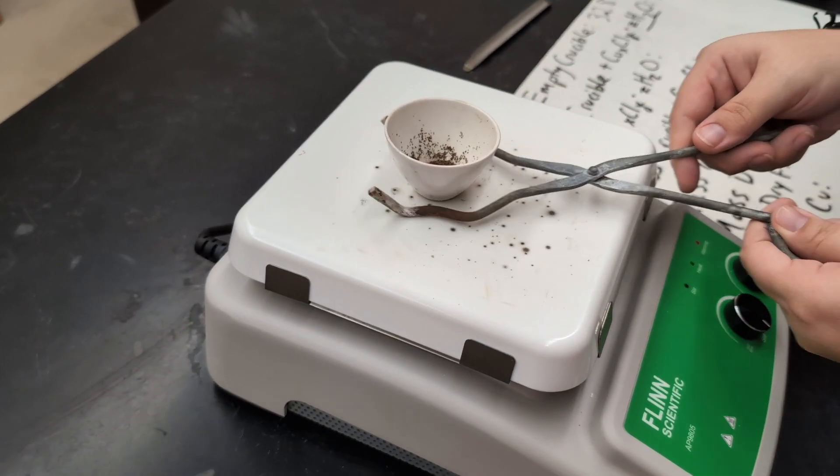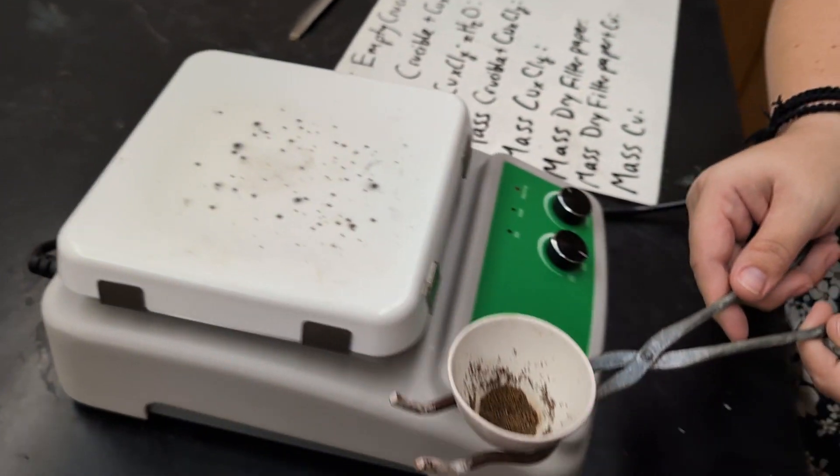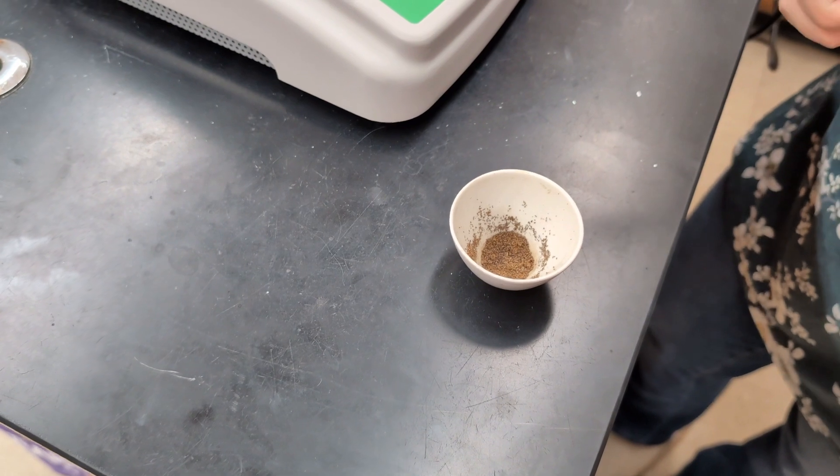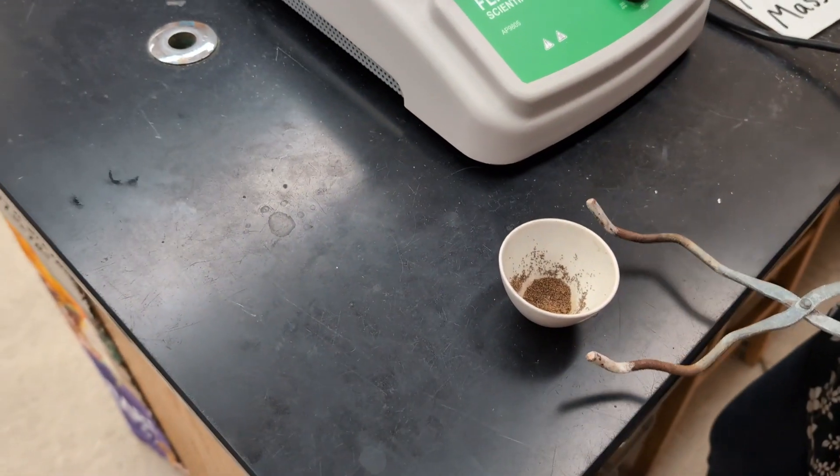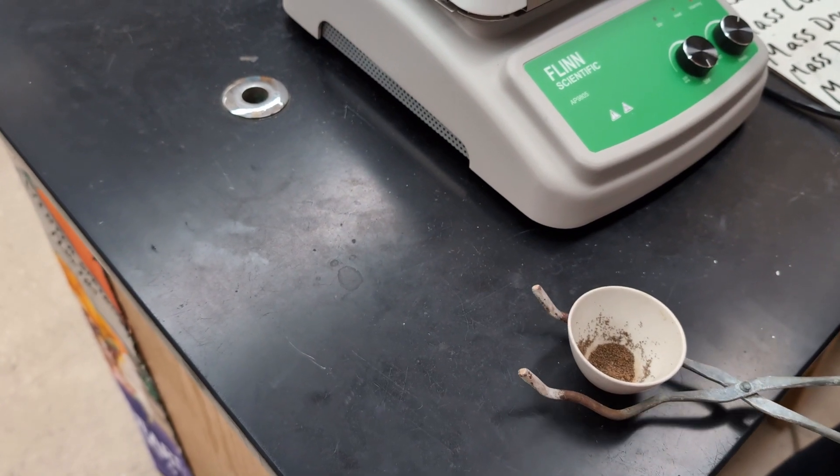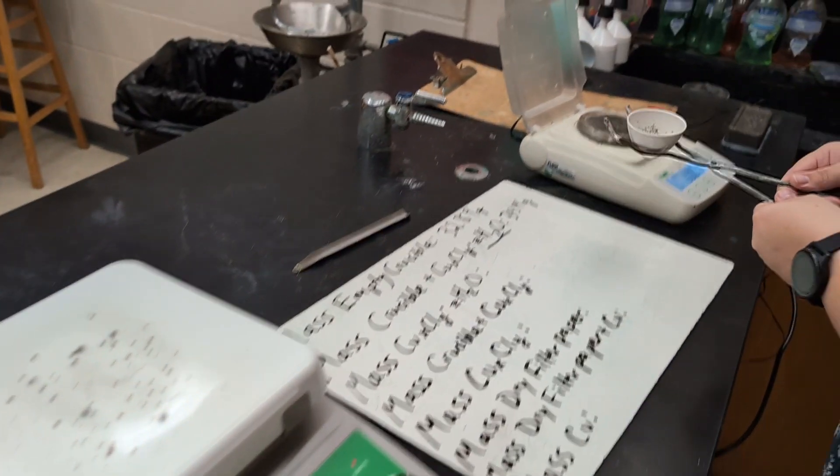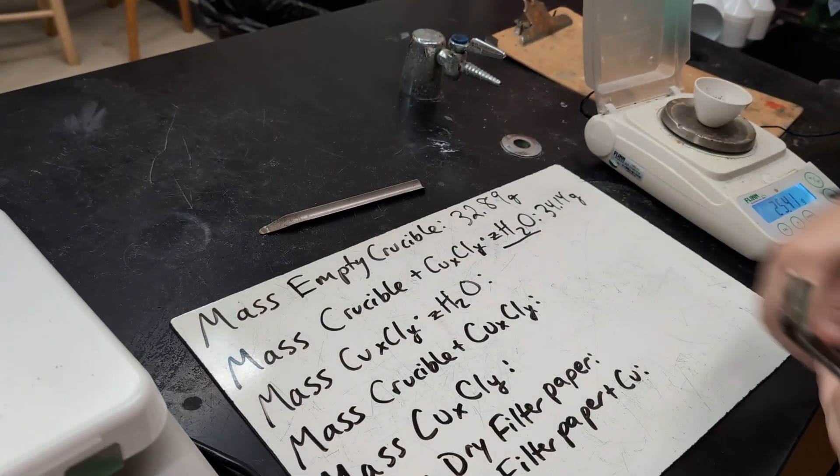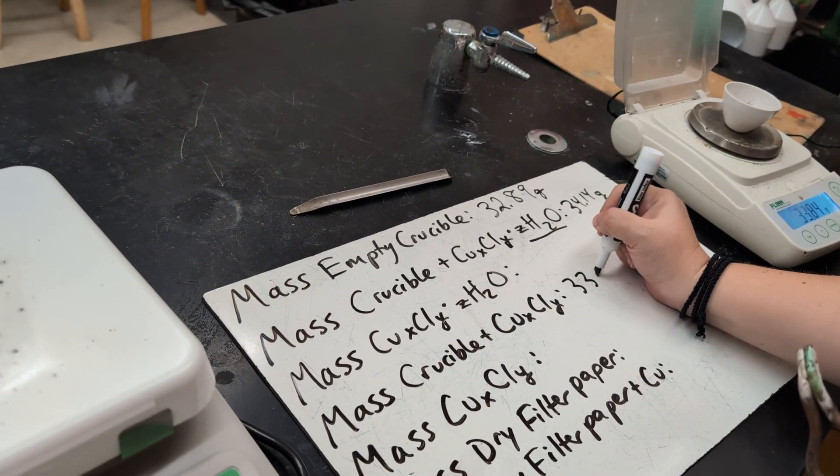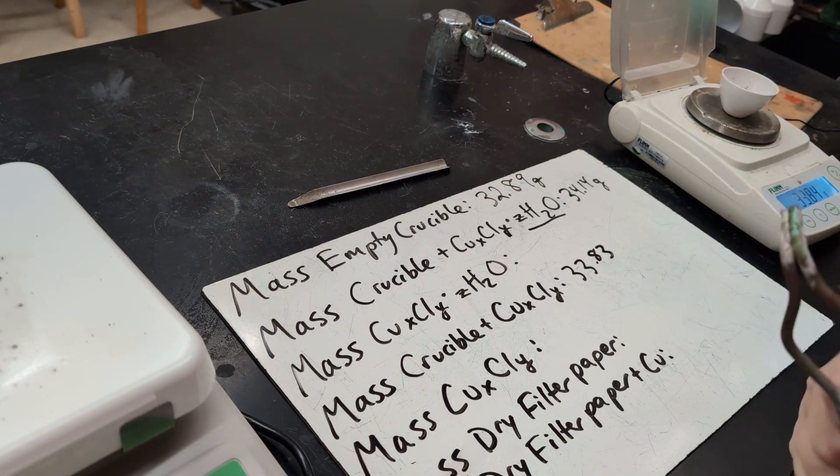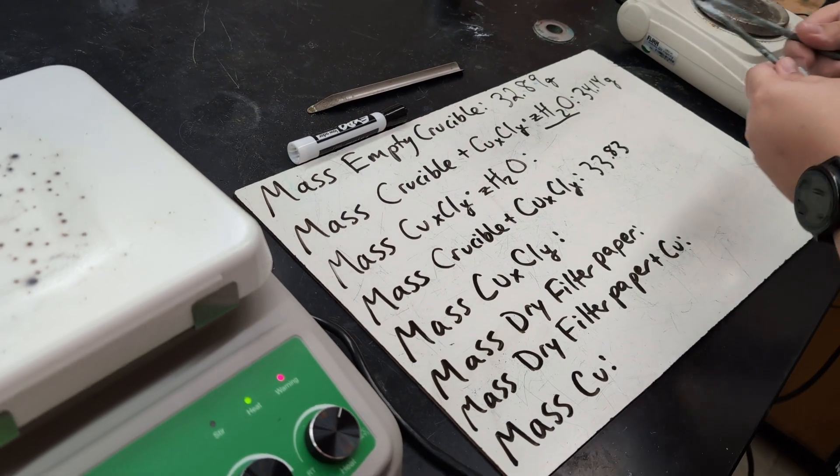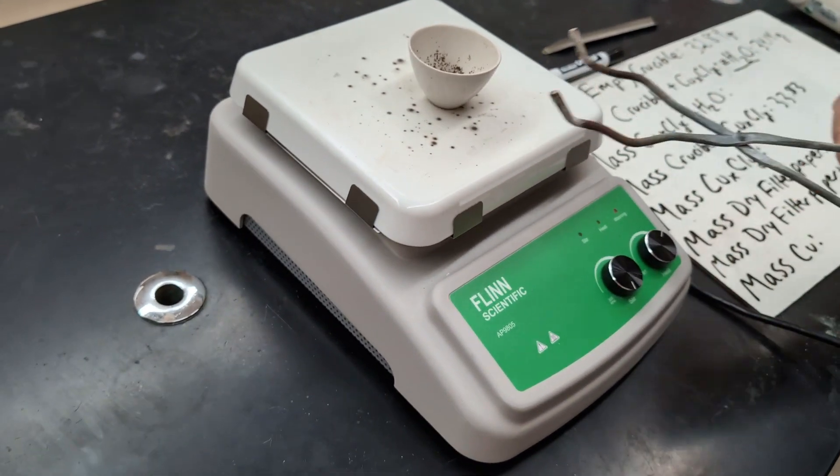So now that it's turned mostly a brown color, we're going to take it off of the heat. Now you can use a Bunsen burner or a portable torch to heat this, but I found a hot plate works pretty well. And we can see that brown color. It has not turned black. We'll record the mass of this. We've got 33.83, but we're going to continue to heat because we need to make sure that it reaches a constant mass. So that way we know that all of the water has evaporated.